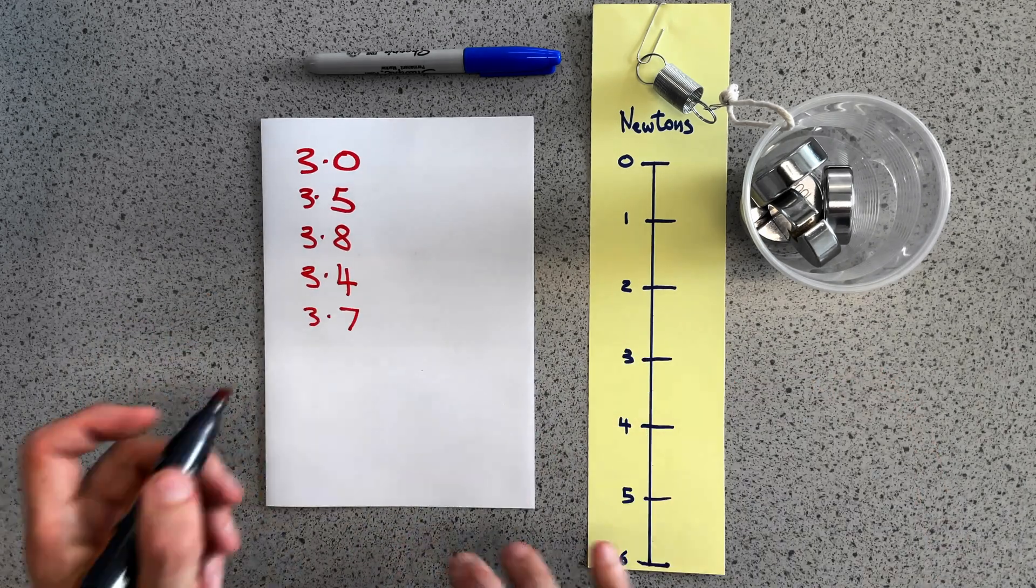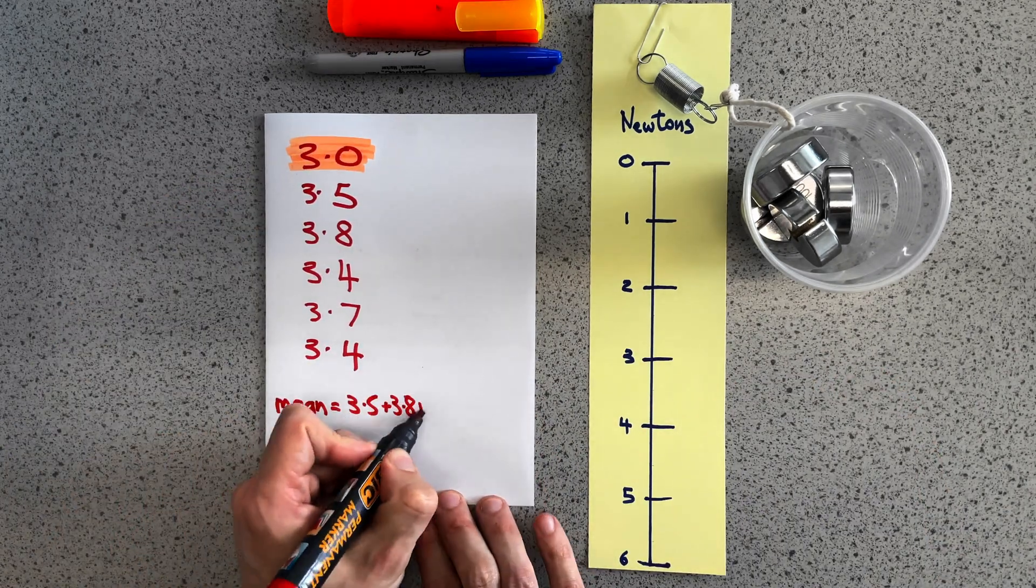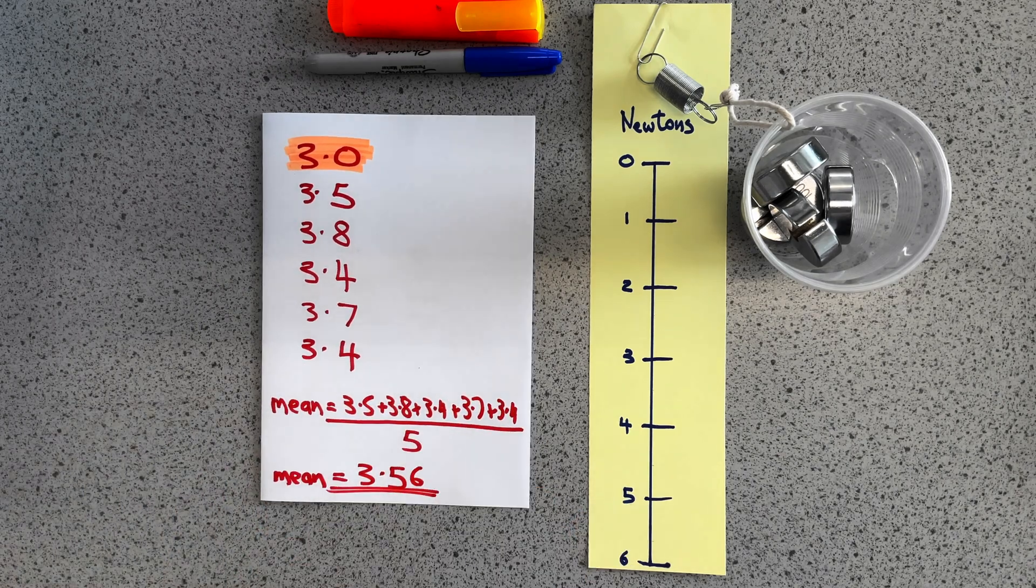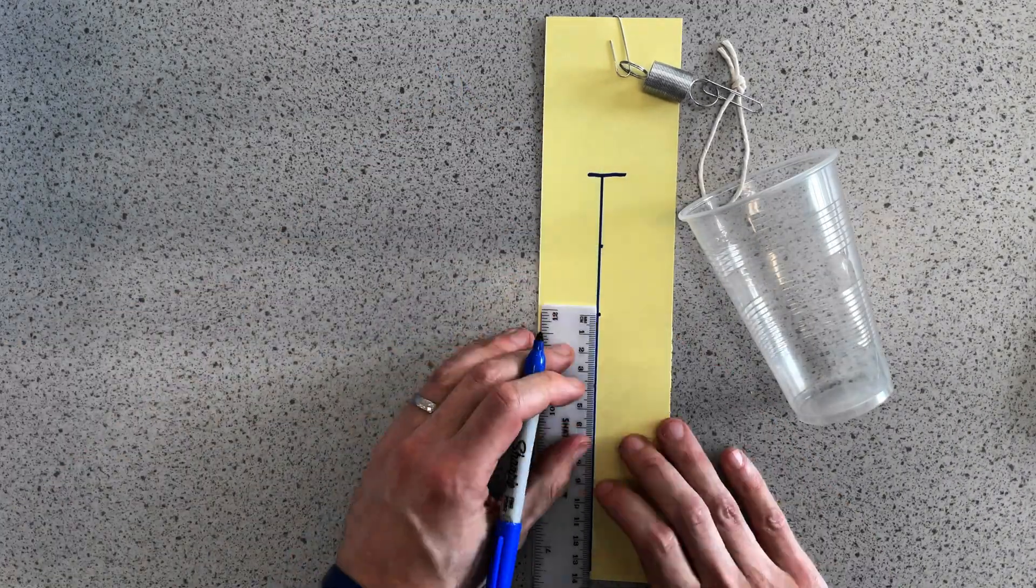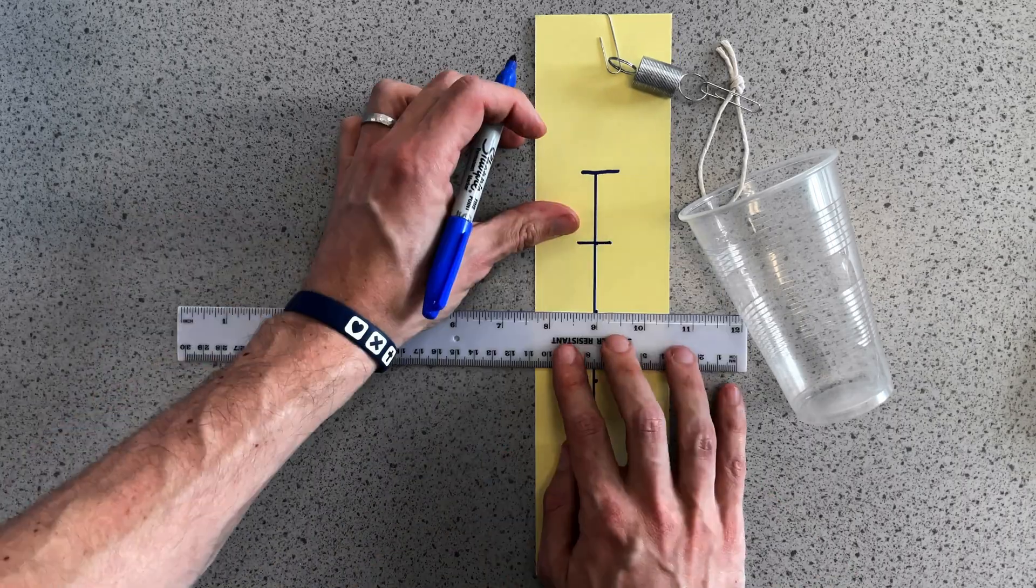So to reduce that as much as possible I can take my different measurements, find the mean and then I can make a new force meter with that mean reading as the distance between all my marks.